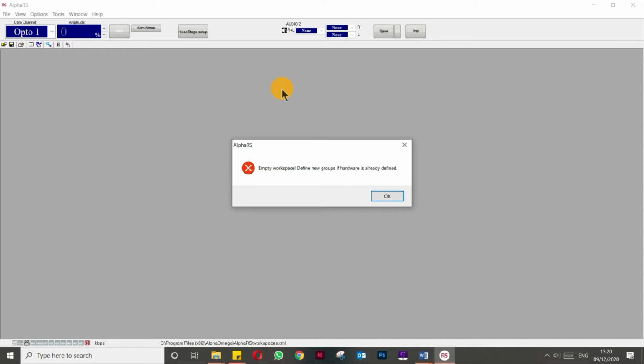Hello everyone, in today's video I will be talking about the alphaRS software setup and features. The first thing you want to do is double click on the alphaRS icon and open up the software.